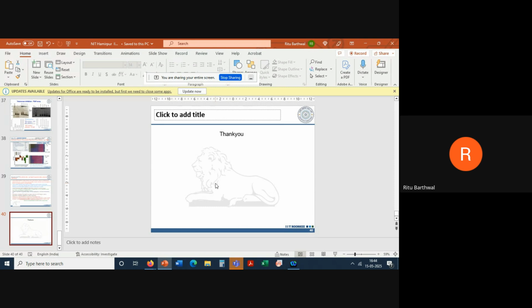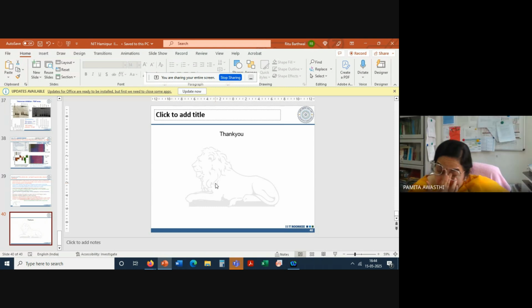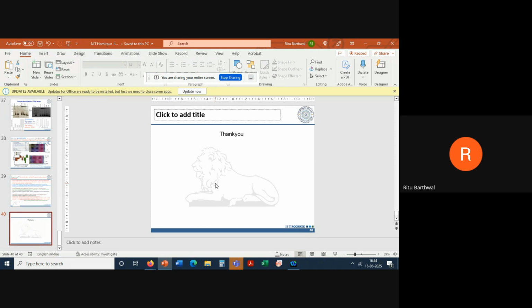Specific, wherever there is quadruplex DNA, it's binding just to that. Yes, those are being developed. So if you want to make it more target specific, so, of binding to quadruplex versus duplex, you will come across such papers also.